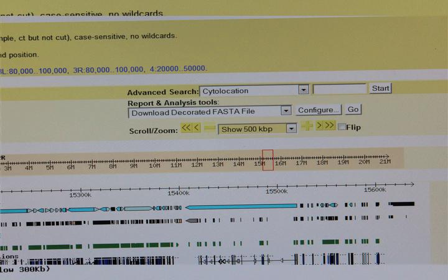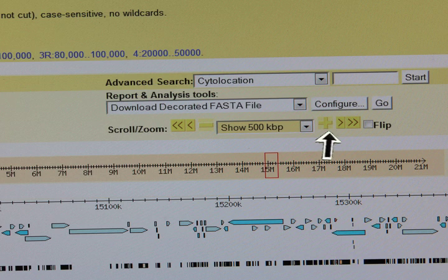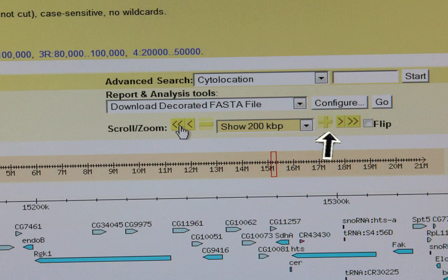There's a page up, page down function, which is found on these arrows. So you can click over, click downstream and click upstream as you please and look at different parts of this chromosome. So let's say we actually want to look at something specific.